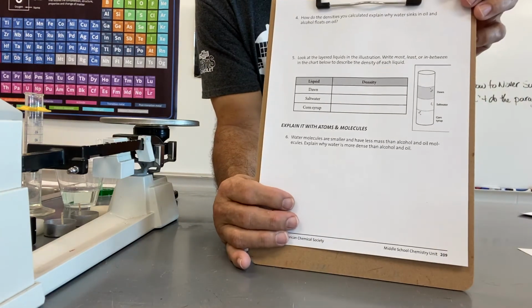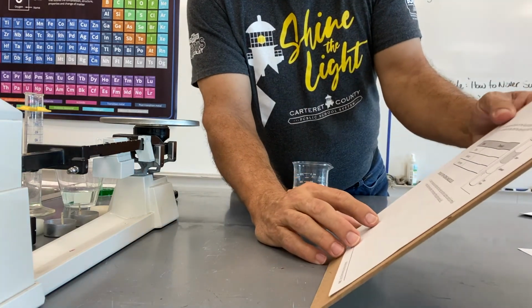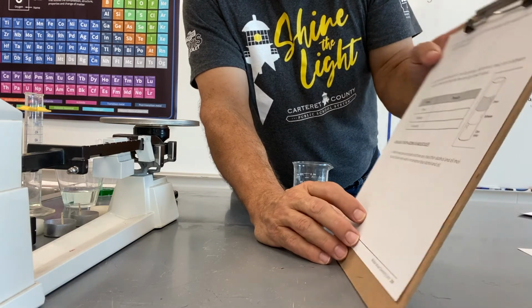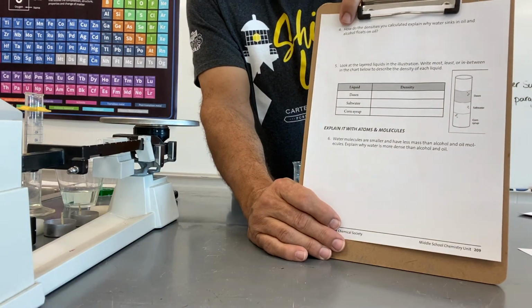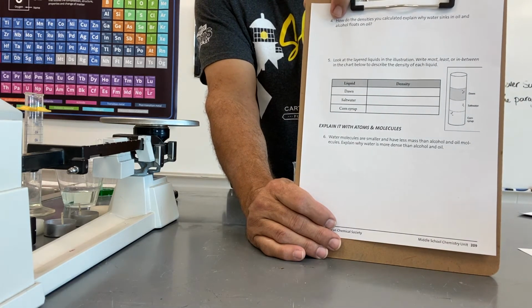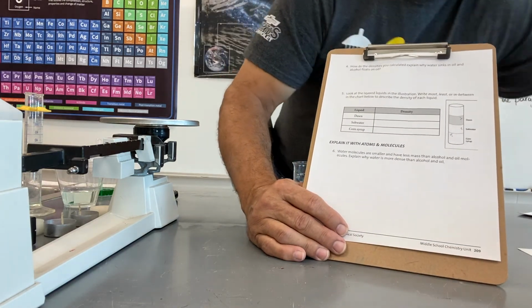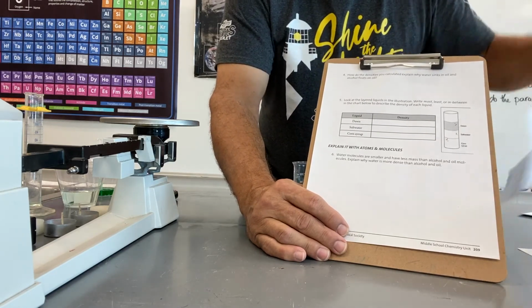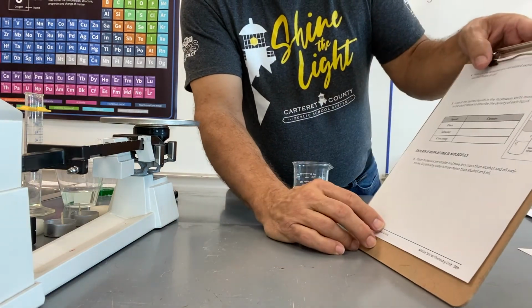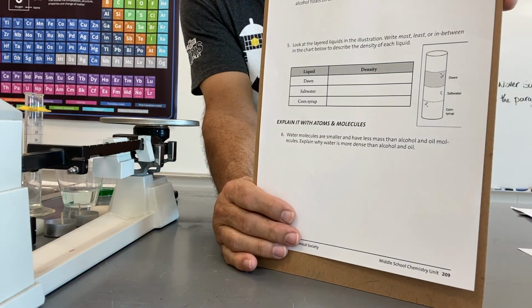All right, we can continue on down our student worksheet now on this page. And here we are looking at number 4, how do the densities you calculate explain why water sinks in oil and alcohol floats in oil? So again, you're thinking back to the density column in our graduated cylinder when we had all 3 liquids in the same cylinder, but then you're using the information from the table that we just did. This table at the bottom of this page to help you answer that question. And then you're also completing this table here, thinking about, again, the density column.